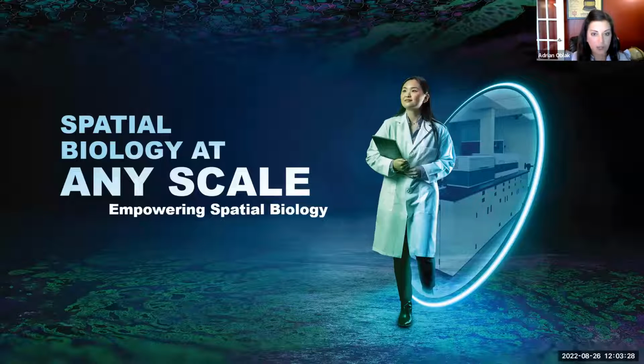If you're not familiar, the SNRI BioCore located over in Stark Neuroscience Research Institute has an nCounter platform with the prep station as well as the GeoMx spatial profiling system. And I think Seth is going to discuss at least the spatial system today and talk about the new technology that's coming online. So I'm going to turn it over to Seth.